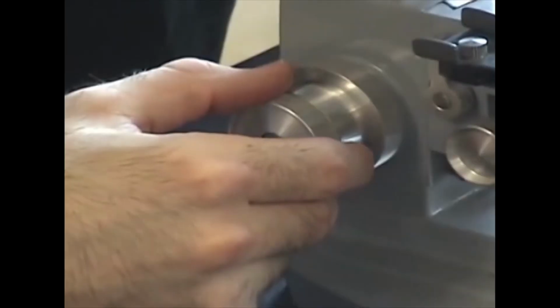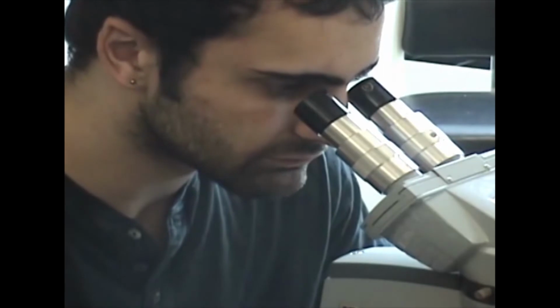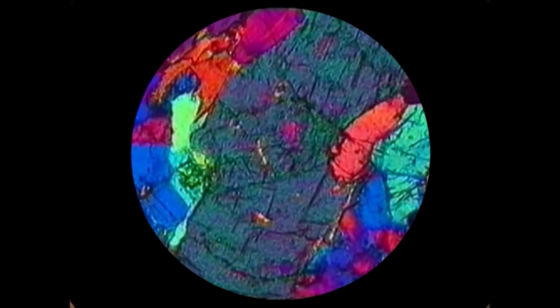Low power objective is used for observing large scale features such as rock texture, and medium power objective is used for general observation, while high power objective is used for observing small scale features and interference figures. Resolving power is the second function of an objective. Quantitatively, the resolving power of the objective is its ability to reveal the fine details.